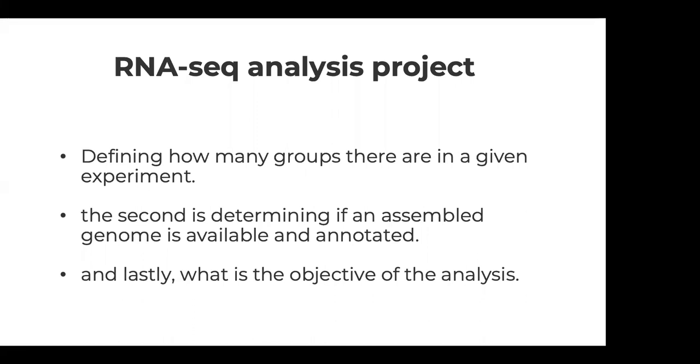Let's first try to understand the experiments that are required for an RNA-seq analysis project. The outcome of this is understanding how we can think about an RNA-seq analysis project. What are the basics? The first thing is defining how many groups there are in a given experiment. So what are groups?